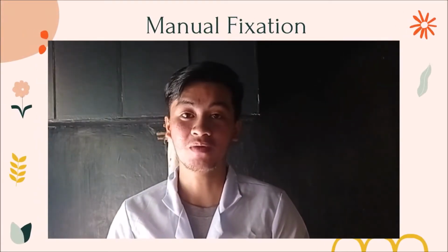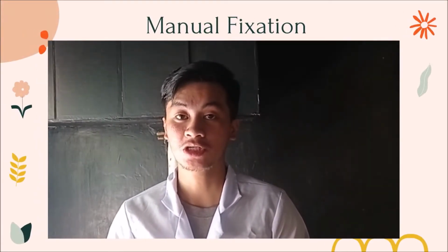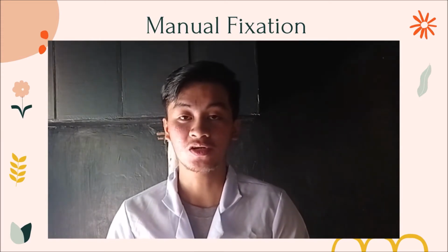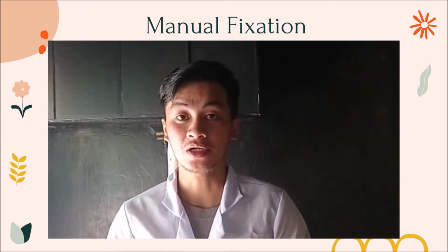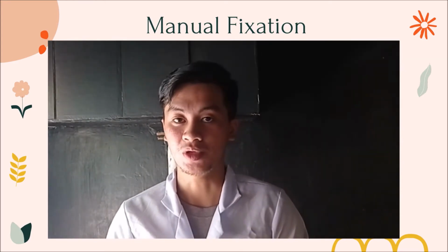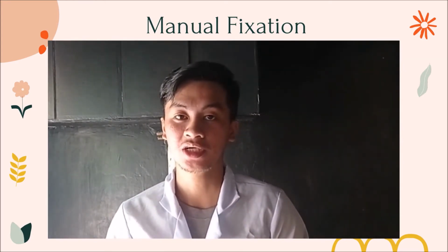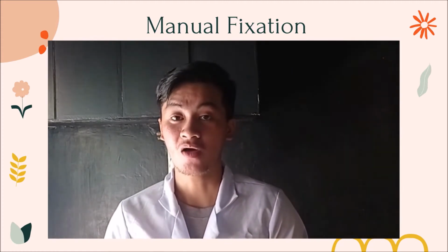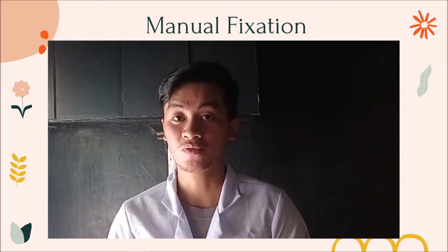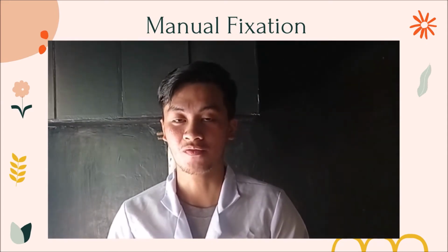Fixation is the first and most critical step in the histopathologic process. This is done in order for the tissue constituents to be preserved with the least alterations from the living state, with the use of chemical agents called fixatives. I am Aton Llevado. Now, we will demonstrate how to perform the proper fixation of the tissue samples.